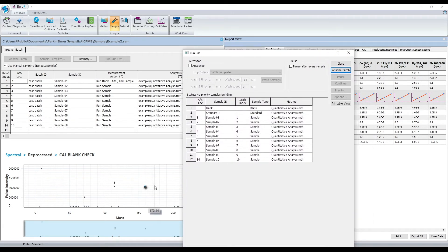If a priority sample comes in during your analysis, you can always add it to the run by clicking on the Priority button. This will ensure that your sample is run next. You can also add additional samples to the run list by using the Append button.